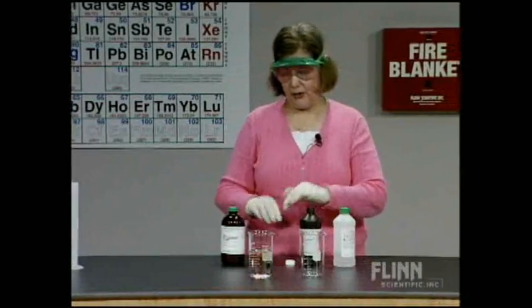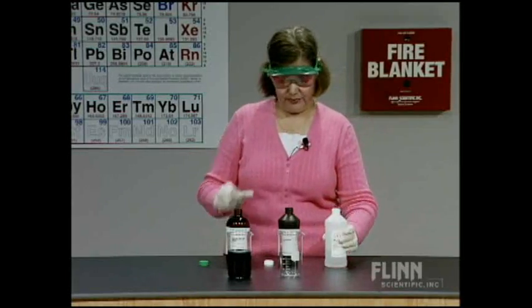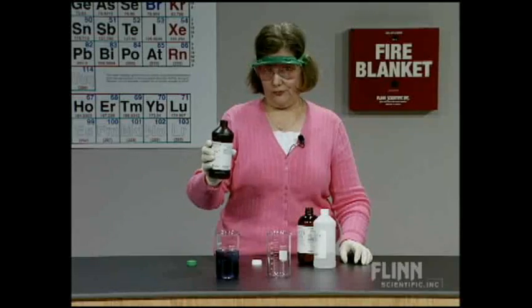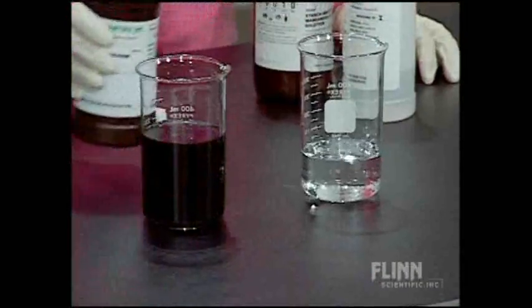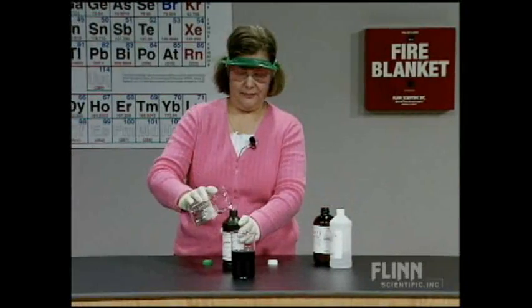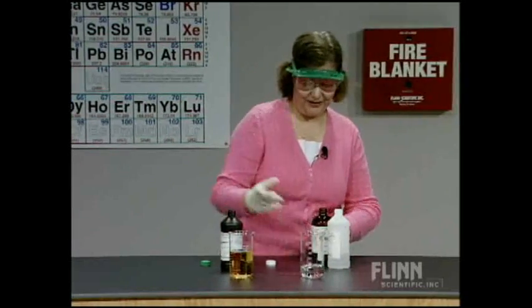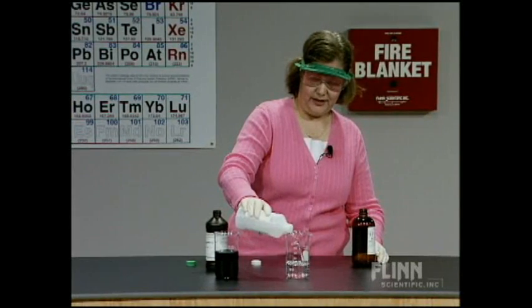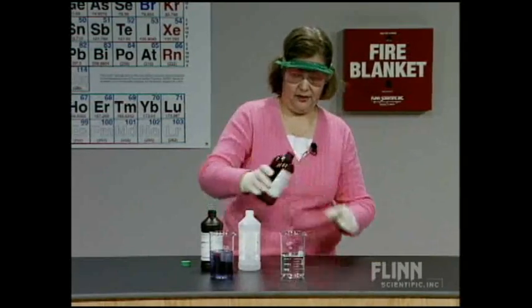Now, I had equal amounts of solutions in my second set of bottles. So what I'm going to do here in the second beaker is add them, and I'm going to do it in the same order. I don't have to measure it, I don't think. Let me see how much. Actually, I do, because I'm going to go larger than my amount. Sorry about that. What I'm going to do here is go 100 milliliters in each. I thought I had a big enough beaker there for all that was left. That's okay, though. We'll go ahead and add our second reactant, and we're going to go to 200 with that, and then our third.